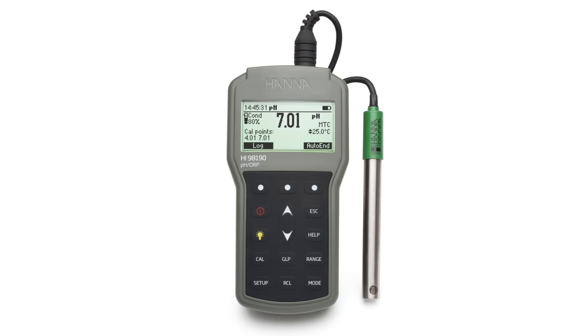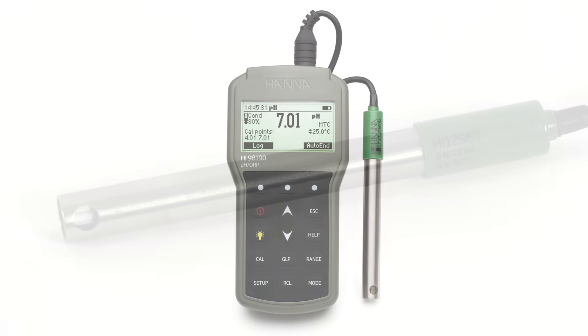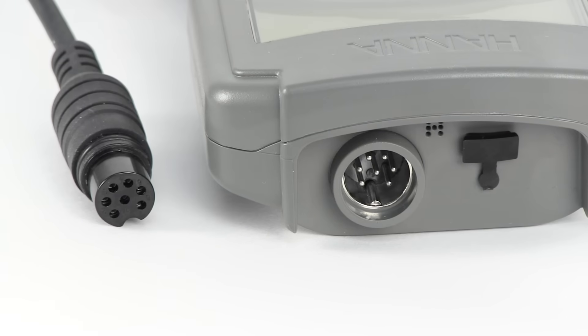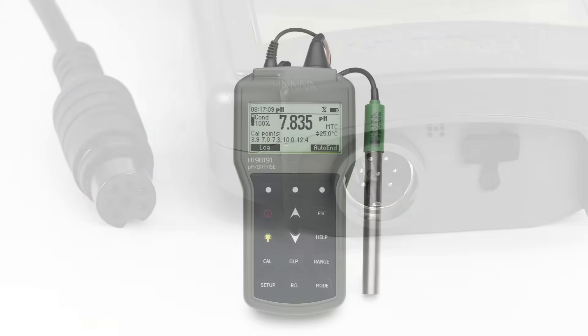The HI-98190 portable pH millivolt meter comes equipped with the amplified HI-12963 combination gel-filled pH temperature electrode, which connects to the meter with a single DIN connector.